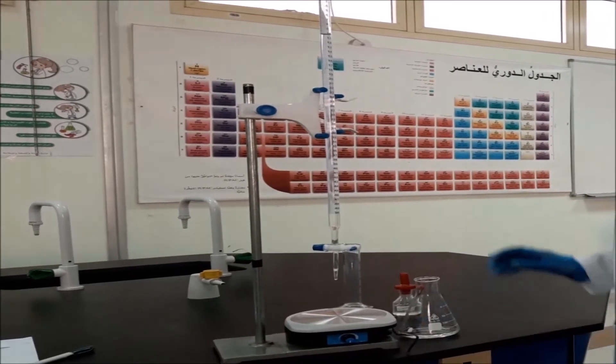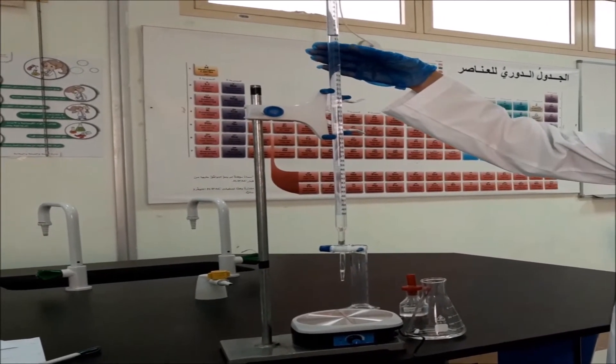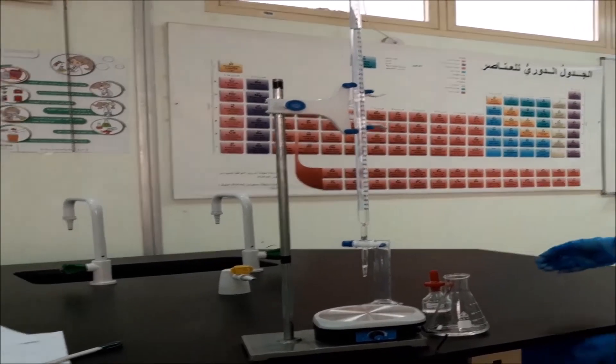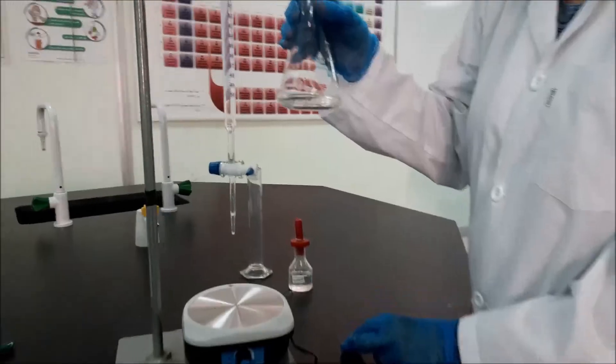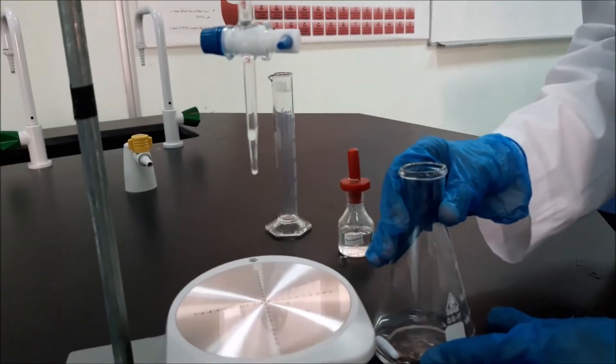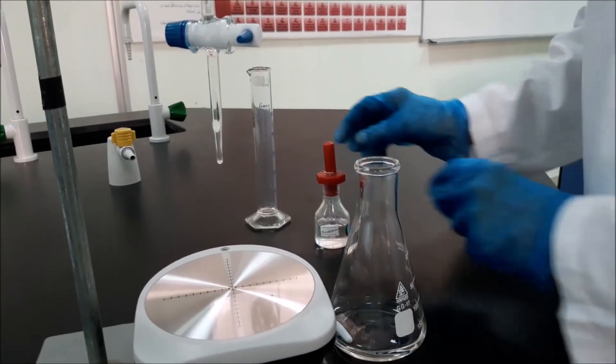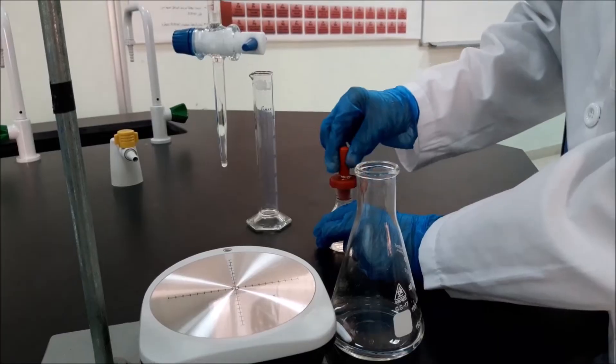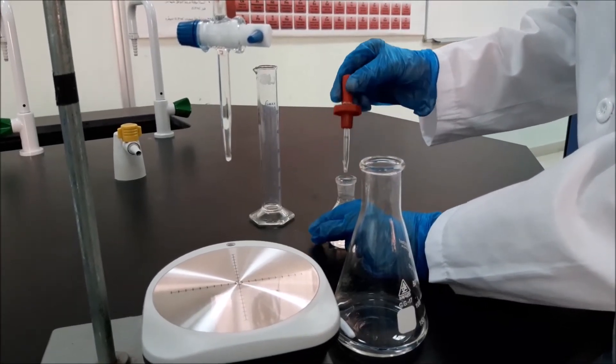For trial 2, the initial reading of NaOH is 10 ml. I have here 20 ml acetic acid. I will put 3 drops of phenolphthalein in the acetic acid.